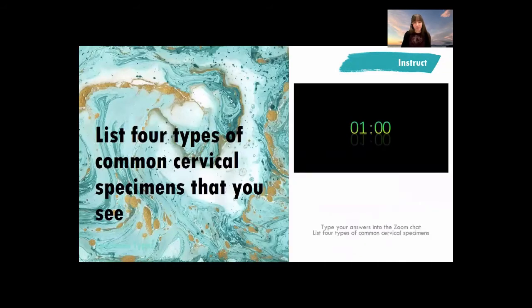Now we will talk about specimen types, but first it is time for another interactive activity. Please list at least 4 of the cervical specimen types that you see commonly in your laboratory. How did you get on thinking about the types of specimens?